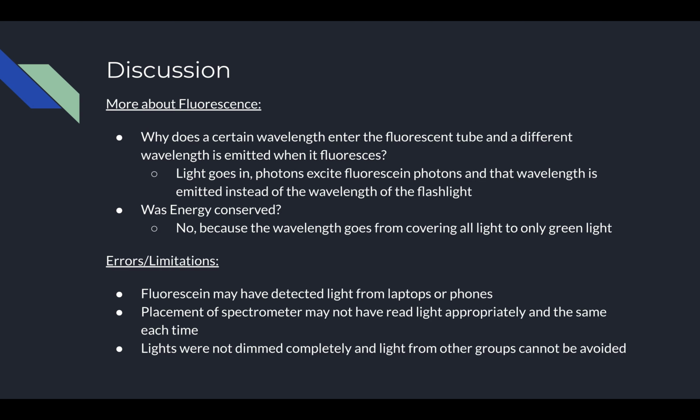When we were testing the fluorescein, other light may have been detected from laptops or phones, and the placement of the spectrometer may not have read light appropriately the same each time. Lights were not dimmed completely, and the light from other groups could not be avoided.